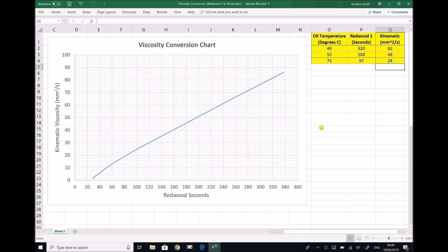To summarise, in this video we've used a Redwood viscometer to determine the viscosity of 10W40 synthetic oil at a range of different temperatures. Once we established the viscosity in Redwood seconds, we then used the conversion graph in order to convert those viscosities into kinematic viscosity in millimetres squared per second, also known as centistokes.